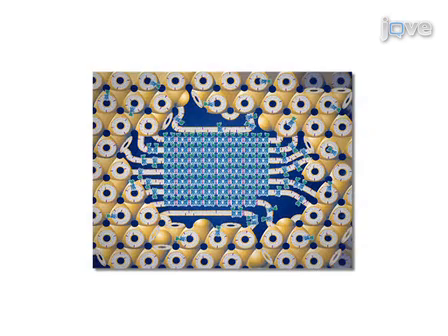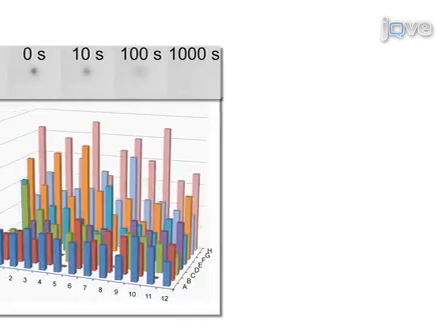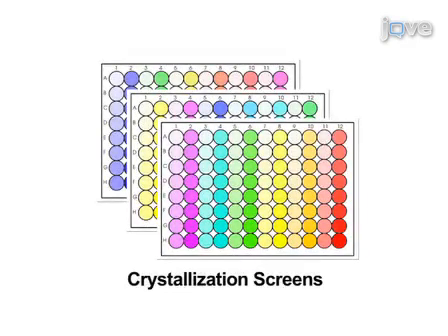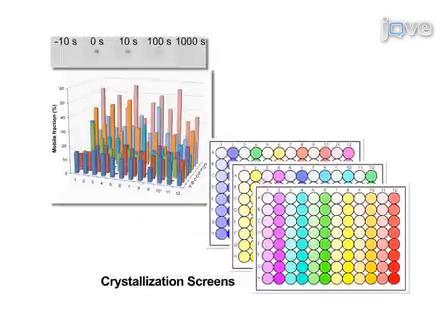Due to a vast size of crystallization space and a limited feedback from crystallization experiments, the lipidic cubic phase fluorescence recovery after photobleaching, or LCP-FRAP, pre-crystallization assay was developed to select for the most promising crystallization conditions. This assay reduces the amount of screening and increases chances of obtaining initial crystallization hits.